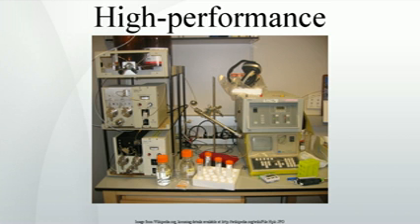They are analogous to the calculation of retention factor for a paper chromatography separation, but describe how well HPLC separates a mixture into two or more components that are detected as peaks, bands, on a chromatogram. The HPLC parameters are the efficiency factor, N, the retention factor, kappa prime, and the separation factor, alpha.